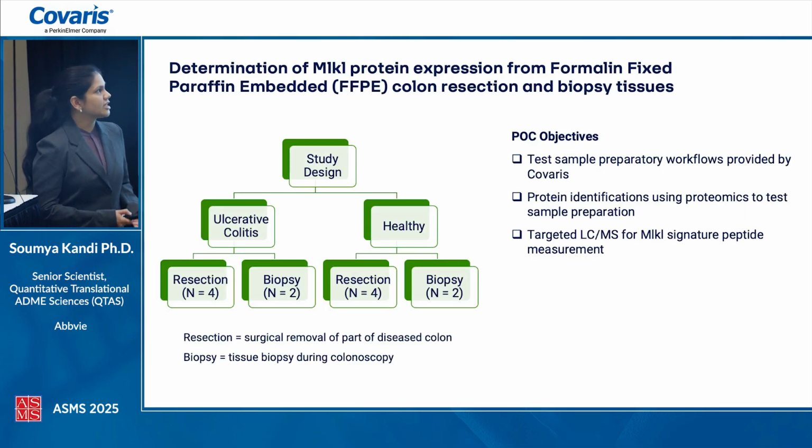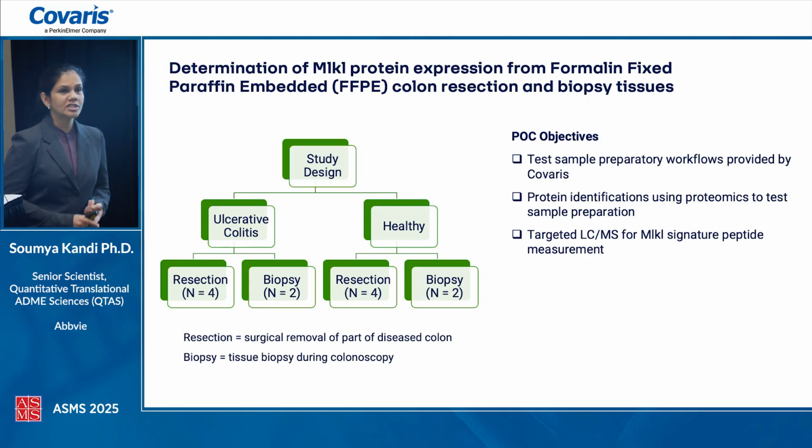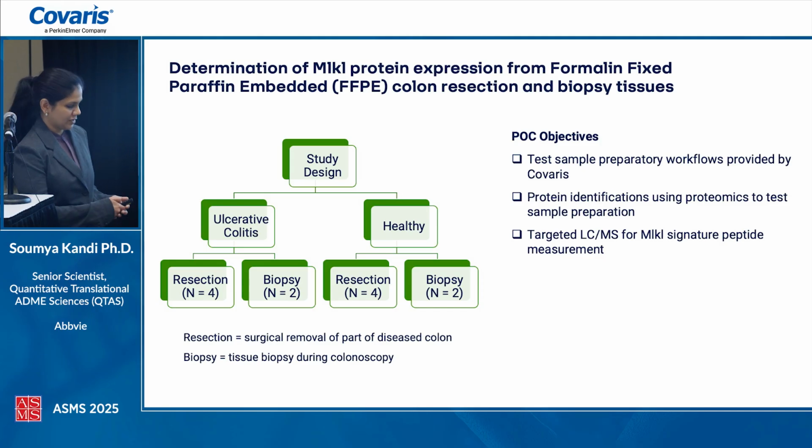So now that we had tested the sample prep workflow with the Covaris system, and it worked beautifully with the high power settings, we didn't want to spend more time with the optimization, but rather go into actual biological samples and test out the workflow, see what we see with proteomics, what we are seeing with targeted protein quant. So the study design is as follows.